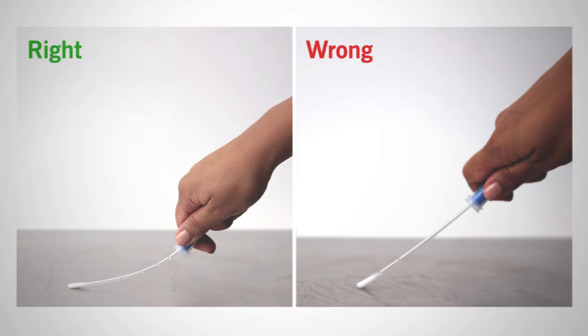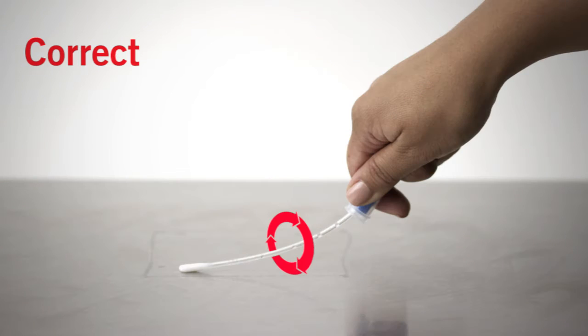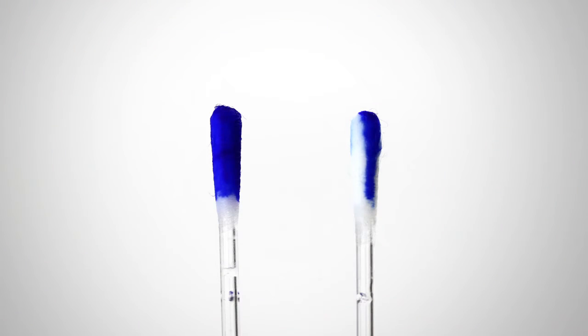Apply sufficient pressure to create flex in the swab shaft. This maximizes sample collection to improve the accuracy of test results. Be sure not to touch the swab shaft when collecting sample, as touching the swab shaft contaminates the test and will produce inaccurate results. Rotate the swab tip while collecting sample to ensure the entire swab tip picks up sample, resulting in more accurate results.